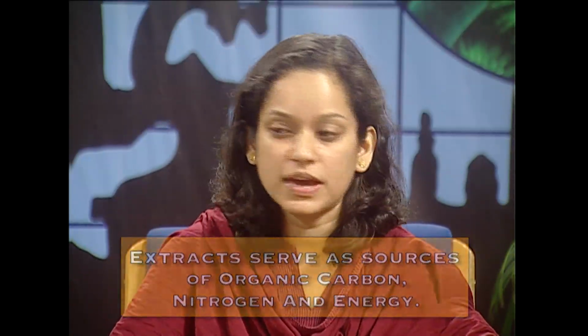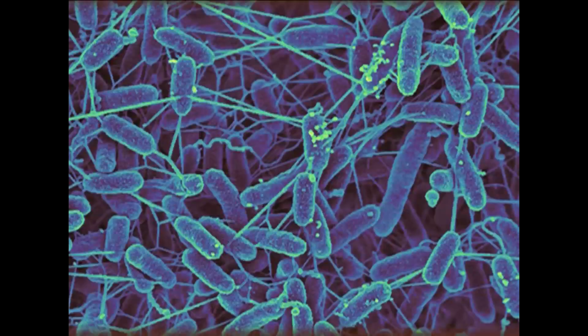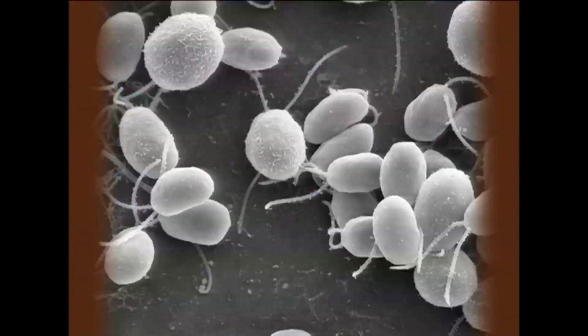Again, the media may contain certain pH indicators in order to differentiate between the different kinds of bacteria growing on the same media. Sodium chloride plays an important role in the culture medium and is often an ingredient in common bacteriological media. Sodium chloride helps to maintain the osmotic balance of any bacterial cell.